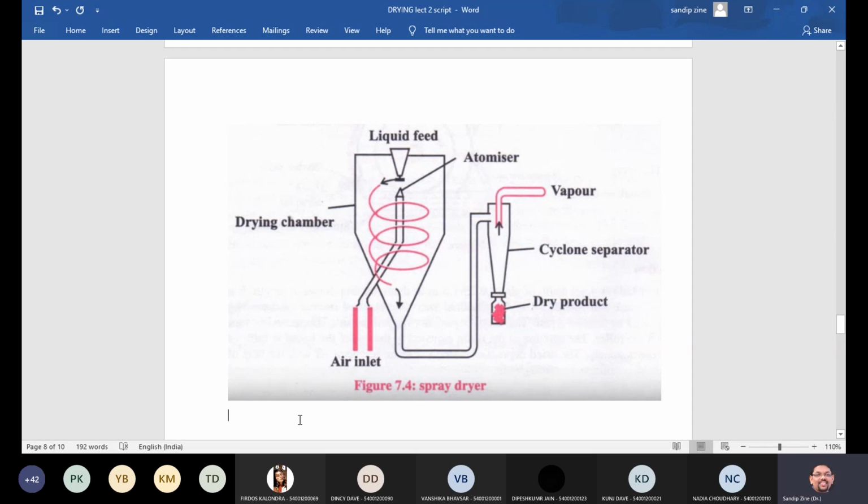So you are getting large space for drying purpose. And in the previous session we have seen, the more space you give, the better the drying will be. And with the help of this atomizer, which you can see here, this atomizer provides the large space for drying purpose.